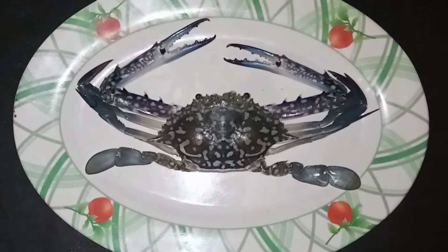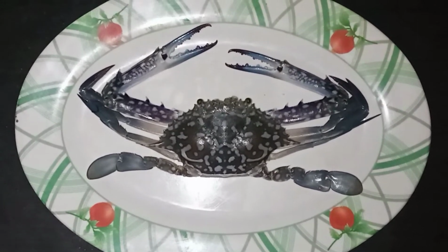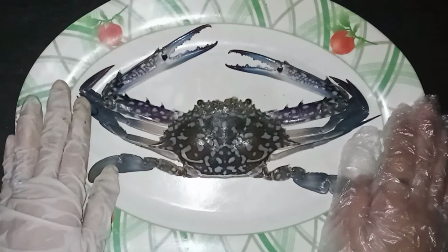For this dissection, we will be dissecting another animal from the phylum Arthropoda, which is the crab. So without further ado, let's start. Of course, before we start and as a part of our drill, we are going to identify first the external parts of the crab, and later on we will proceed to its internal parts. So we have here the blue crab that we are going to use.